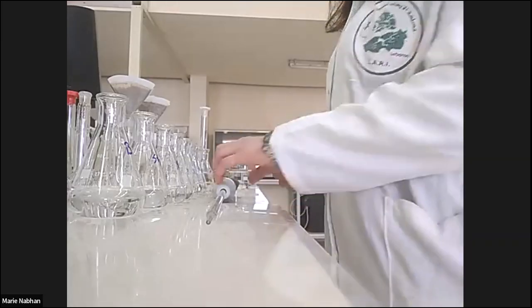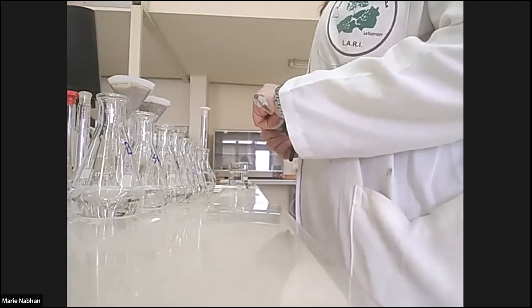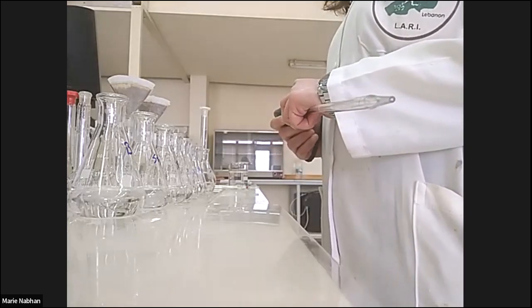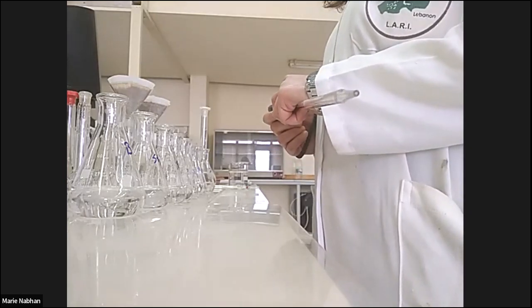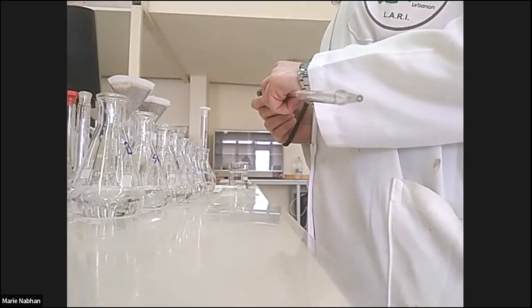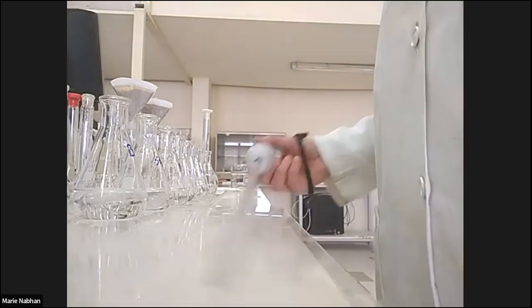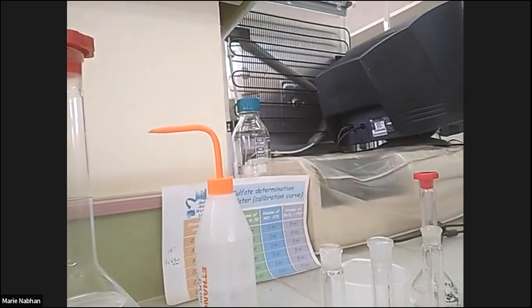So I prepared, we will do the sulfate from soil suspension. As done for water, we have to do a 6-point standard from a solution of 150 ppm.